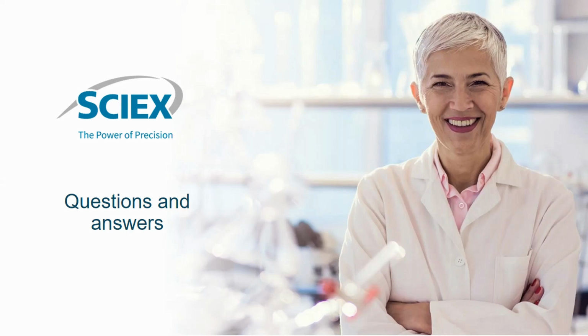Great, thank you, Philip. Next question here asks, how is capillary gel electrophoresis better than SDS-PAGE? So when you're comparing capillary electrophoresis and SDS-PAGE, there's a comparison between capillary electrophoresis and slab gel electrophoresis or SDS-PAGE. And one of the main benefits of using capillary electrophoresis is that you're going to have much higher resolution and much higher throughput.